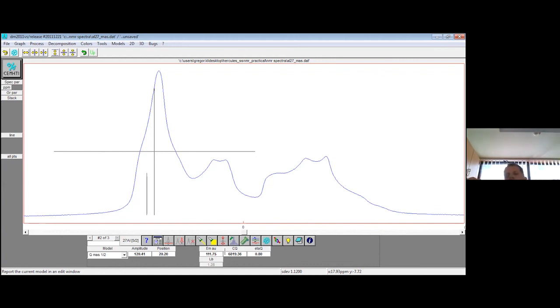Or perhaps you study the distances between nuclei by using these dipolar coupling contributions to the local fields, and try to somehow get some information about the distances between different nuclei, and from this get some structural information about your system.